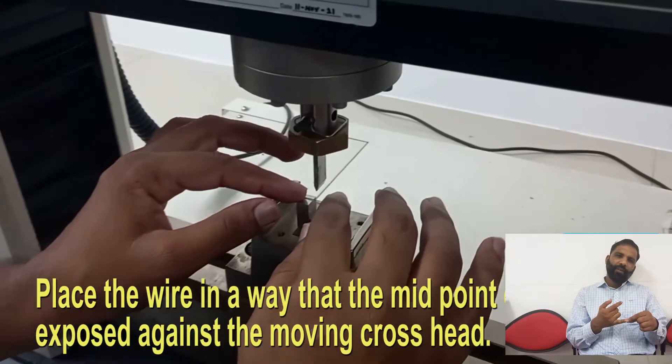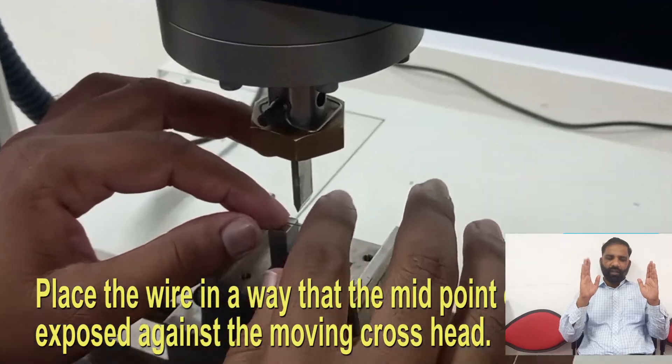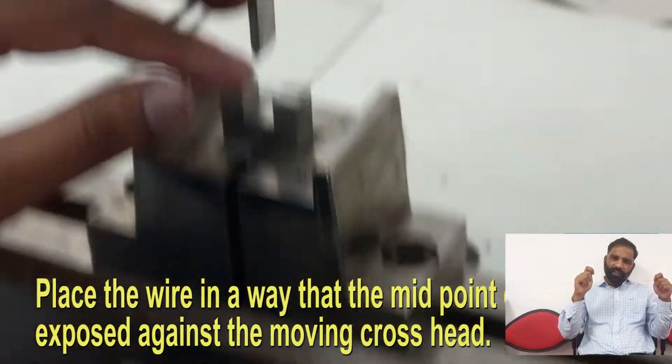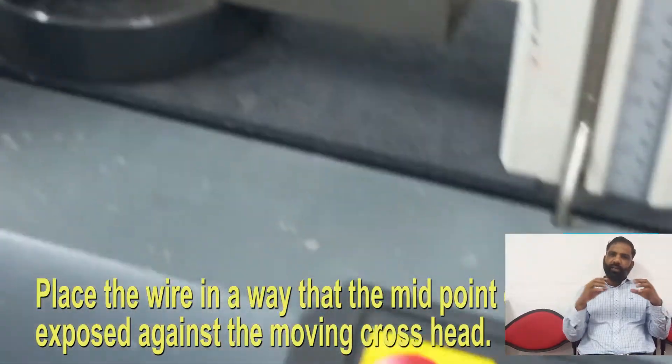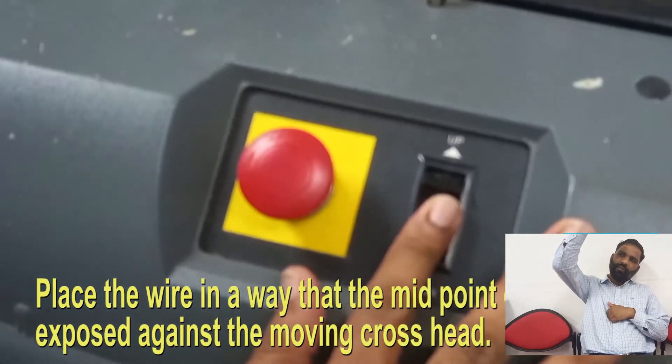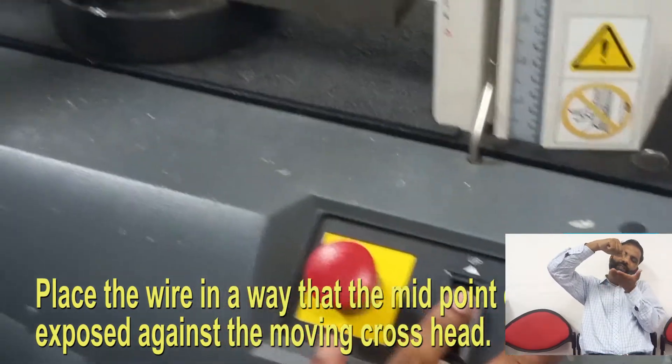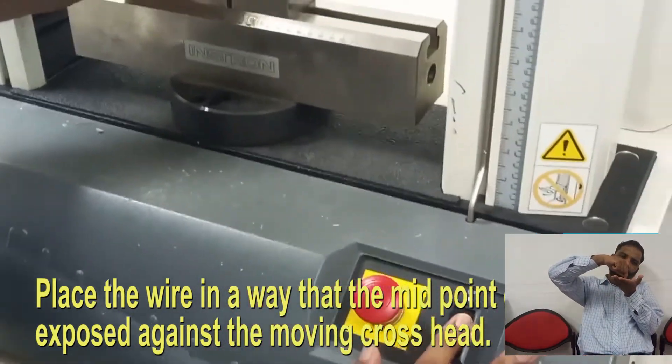We do three-point bending. In three-point bending we take a fixture where we put the arch wire and one indenter which slightly touches the wire.